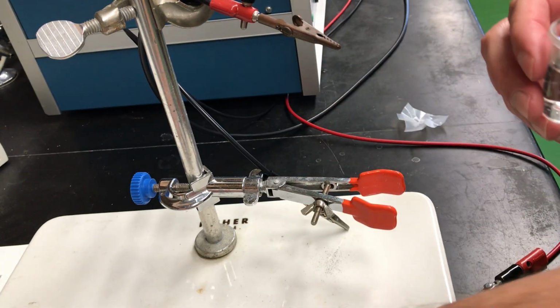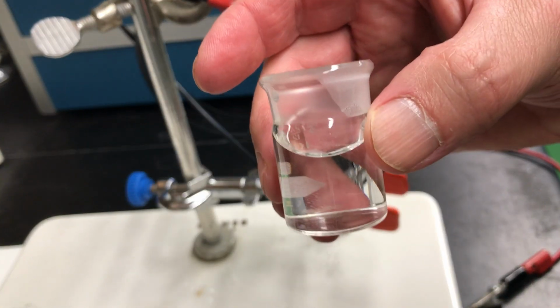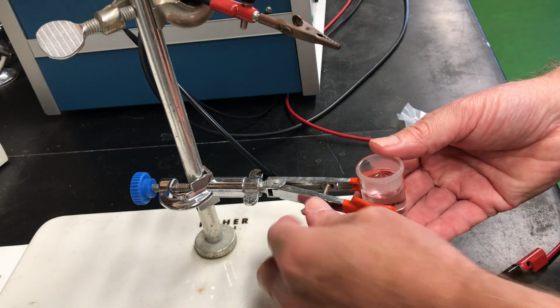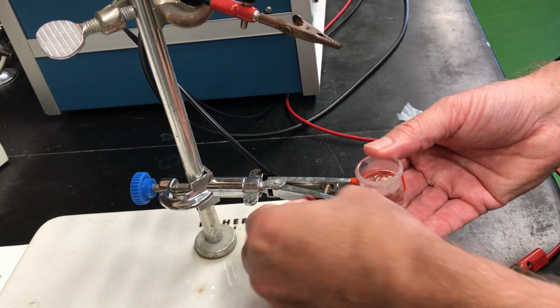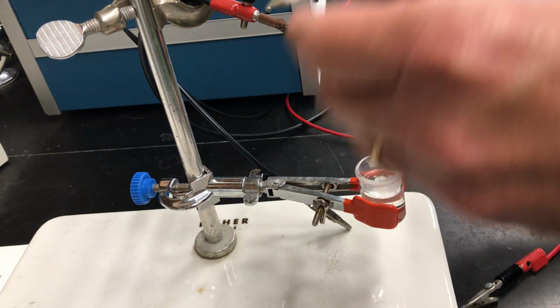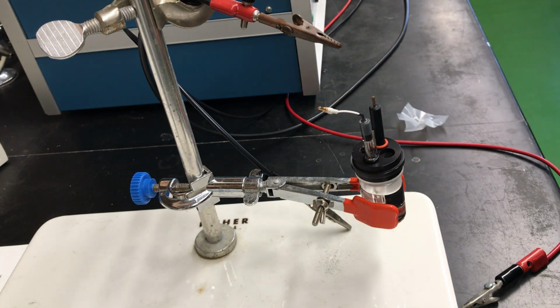And you can use as much of it as you wish. So you can see if I've used all of it, I have my cell container about 3/4 of the way full. So I'll place the cell container back in the clamp, and I can shake off the electrode assembly if I like. And I'm going to place the electrode assembly back in the cell container.